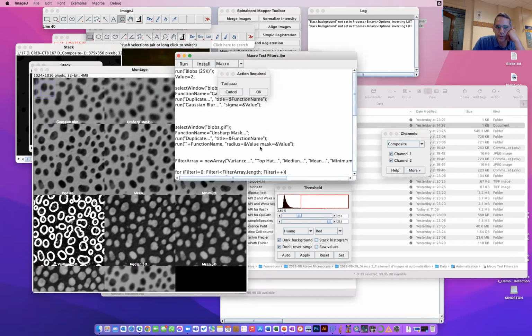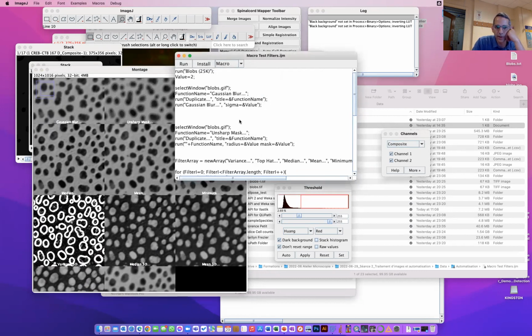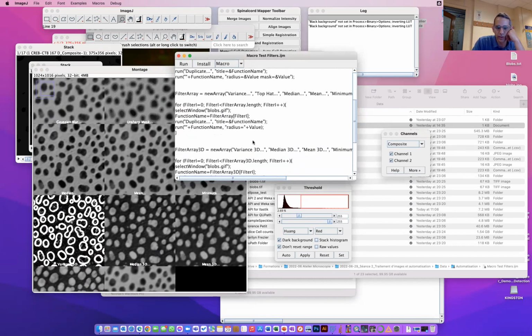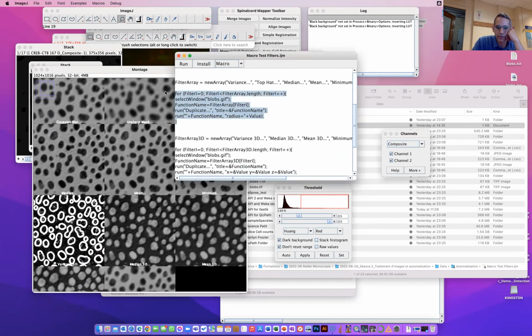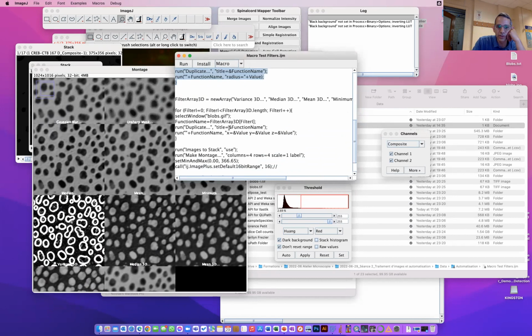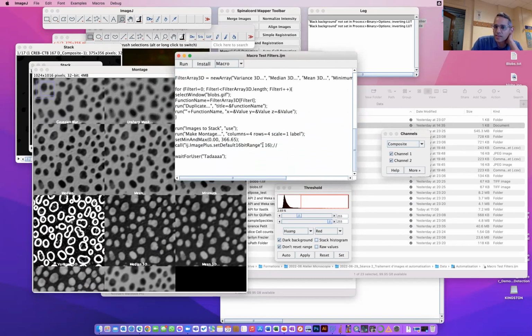I will put the script, the macro, into the course, so you can take part of this. And if you want help to understand how it works, I will explain it to you. But the bottom line is, there are many examples of these online. You are not alone in asking yourself these kinds of questions. Most of the things have already been done. It's just a matter of finding where it is. If you don't find it, or if you need help to find it, you can contact us.